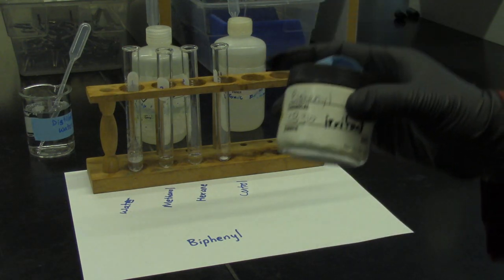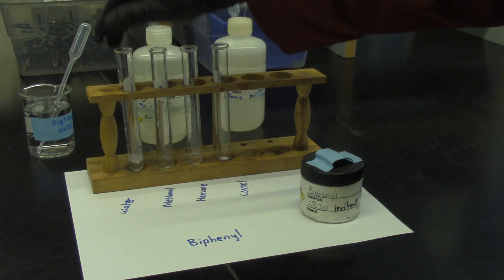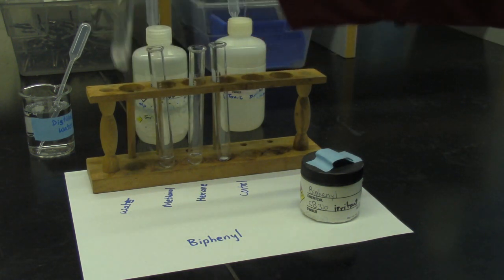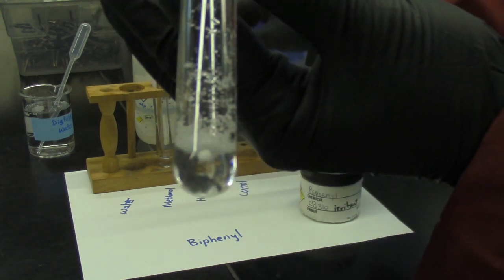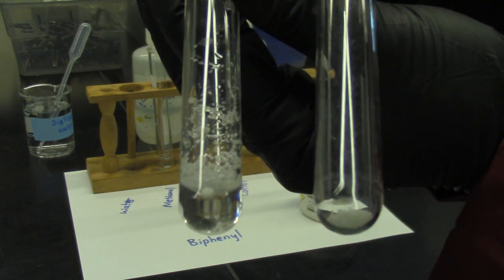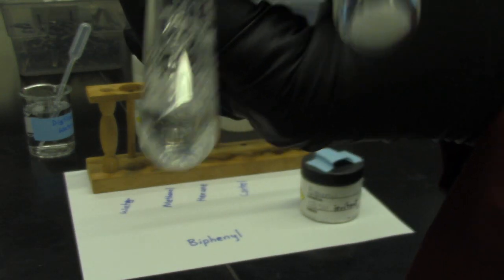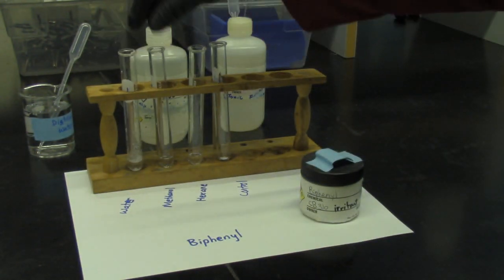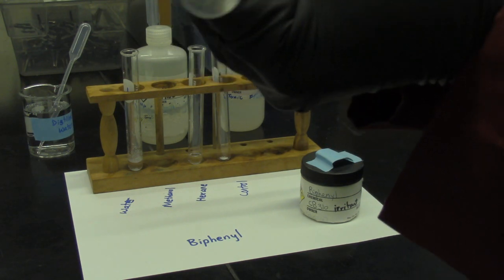Next, we have biphenyl in 1 ml of water. After mixing for 60 seconds, this is what you have. Write down the observation and compare with the control. Test tube number 2 is with methanol and biphenyl.